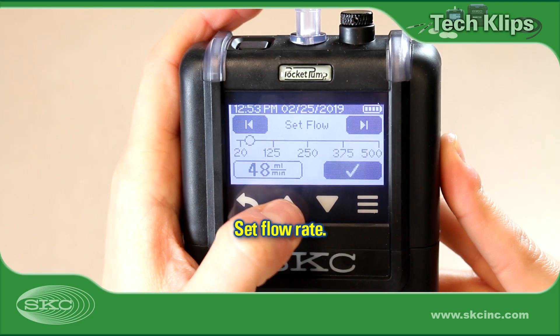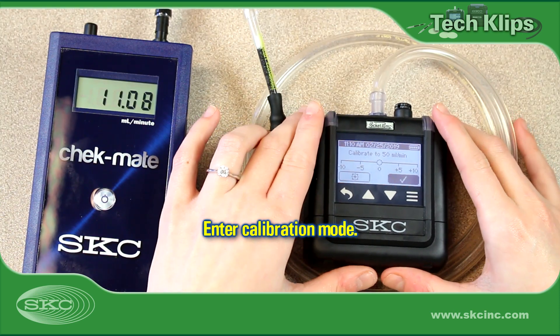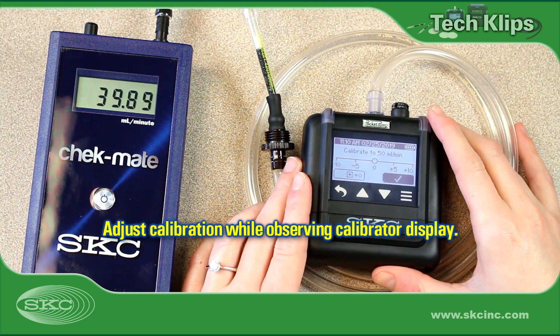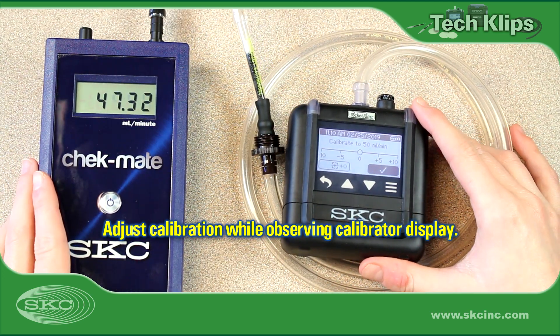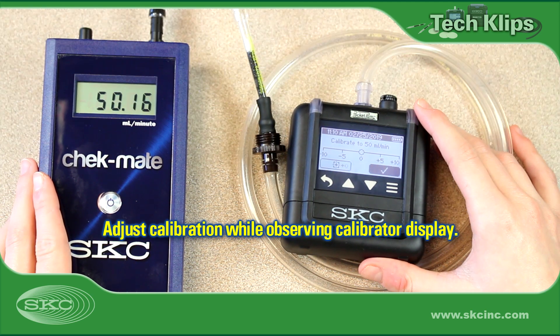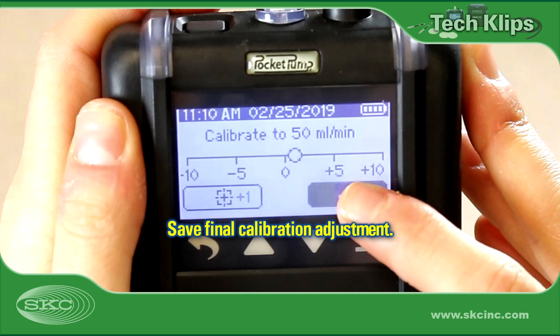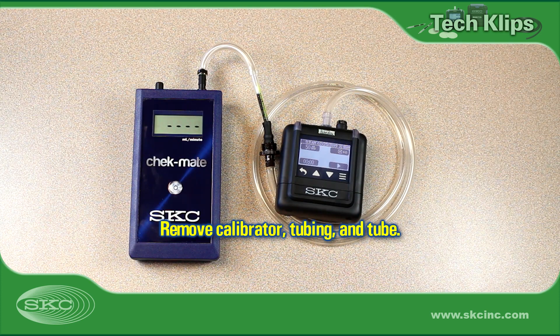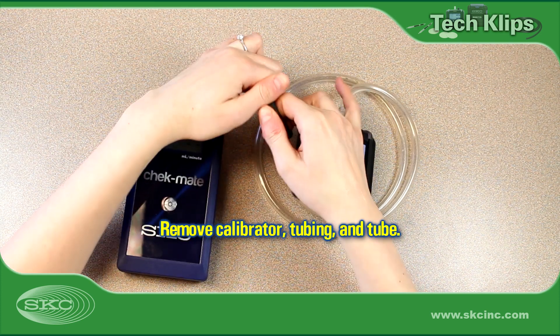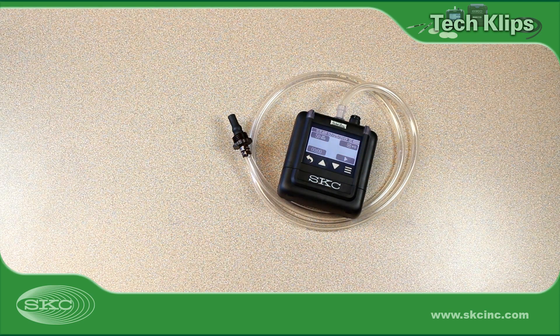Set the method-specified flow rate on the pump. See pump operating instructions for details. Enter pump calibration mode and adjust calibration until the reading displayed on the calibrator remains within five percent of the set flow rate. Pump and calibrator steps will vary with model. Be sure to save the calibration adjustment on the pump. Remove the calibration train and keep the low-flow tube holder attached to the pump for use in collecting the sample in the field.